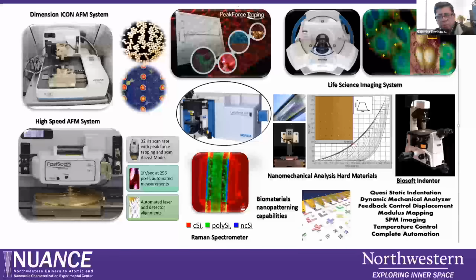We have been using it with the medical school for the last couple of years, a pretty useful and simple to use system. Then we also have a bioscope system that we are almost discarding for certain regions. But this bioscope is still available, where you can do a lot of imaging in fluidic systems. We are trying to incorporate that fluidic system into one of the Icon systems, so that imaging capability will still be there. And in the bioscope, you can do a combination of fluorescence microscopy and scanning probe microscopy.